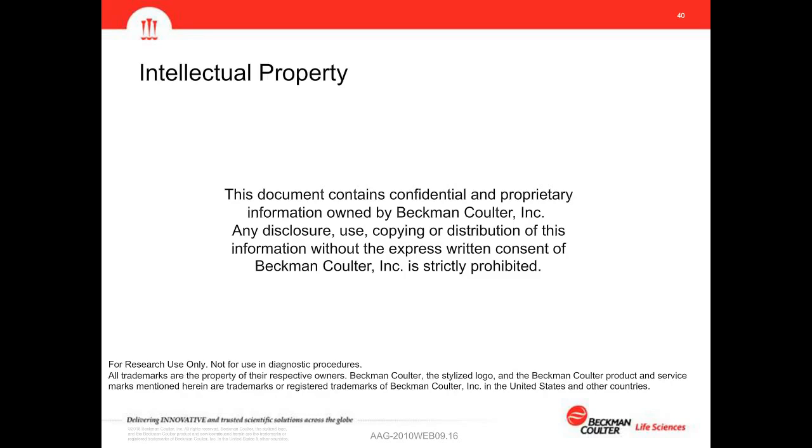So in case of well A1 having sample ID ABC123, let's say we transfer that to an assay plate, and it also goes into well A1. And then maybe we serial dilute, and it goes into B1, C1, and D1. In this case, A1, B1, C1, and D1 of the destination plate will all have the identity ABC123, and any data that gets produced there will be attached back to that sample of origin, and the ID copies along with it.